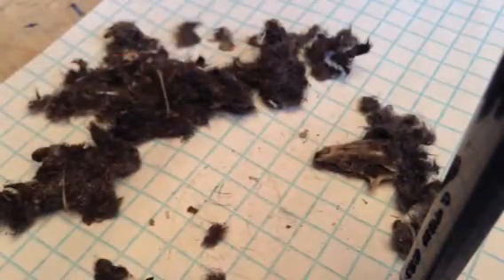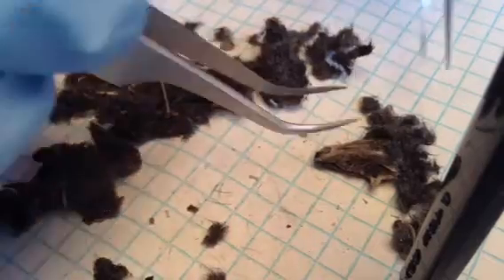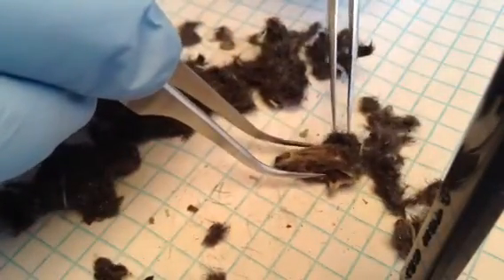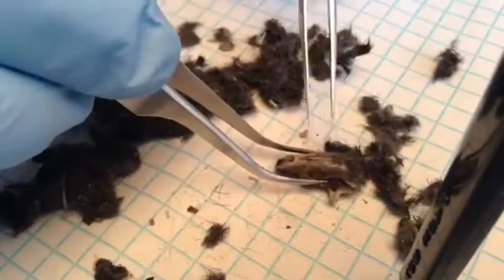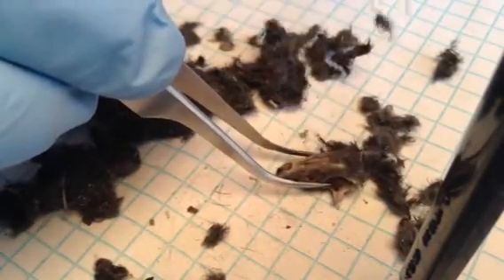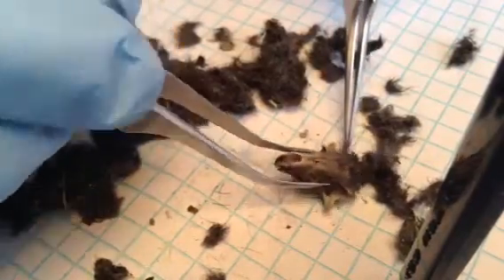Alright, let me get the tweezers out — long tweezers. Hold this skull like that and get all the hair out. You can order supplies like this along with owl pellets right online. At the end of the video I will give you a URL.